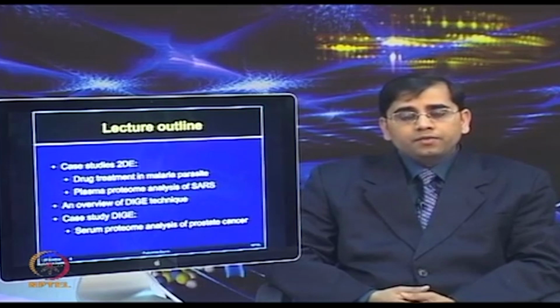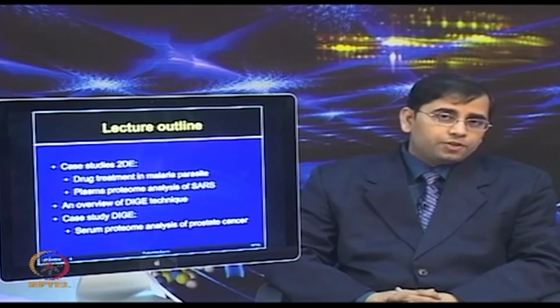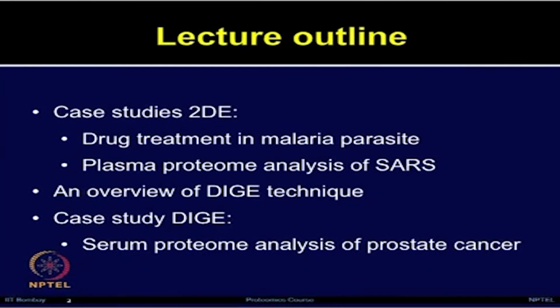Again, if you remember, we have studied that in much detail earlier. Today, I will give you just an overview to refresh you about the DIGE technique, and then we will see one application of DIGE technology, how it can be used for serum proteome analysis of prostate cancer patients.